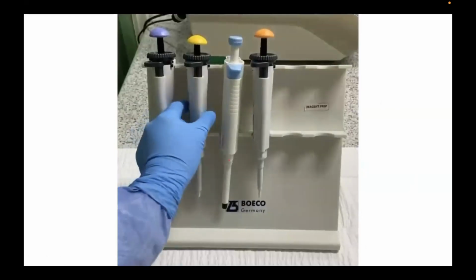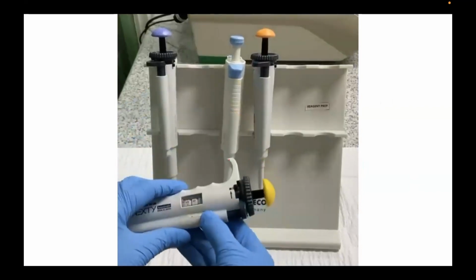So make sure wala pong maiiwan doon sa ating pipette tips na mga liquid para accurate yung measurement natin ng ating volume of the liquid. Ayan. 10 to 45 degrees again. Yan. Make sure na naka-second stop or blow out para lahat po ng liquid na ilagay sa kabilang microcentrifuge tube.